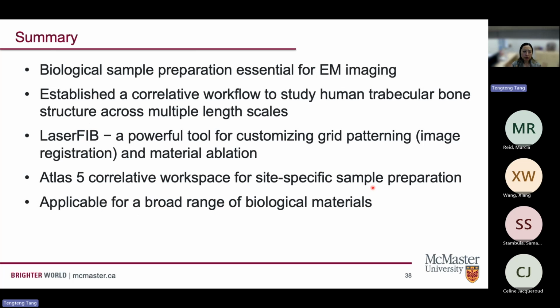So to give a brief summary of my presentation today, for the first part of my talk, I talked specifically about the proper sample preparation of biological tissues for electron microscopic imaging, because that's the starting point for any examination of the structural features of biological tissues. And particularly because of the new acquisition of the cryo-relevant equipment at the CCEM, I think there's great potential for cryopreparation of biological tissues at the CCEM in the future.